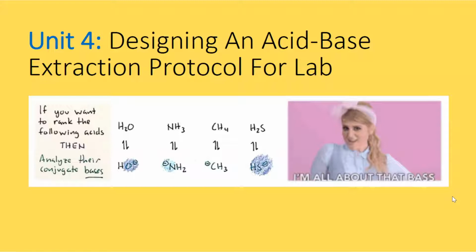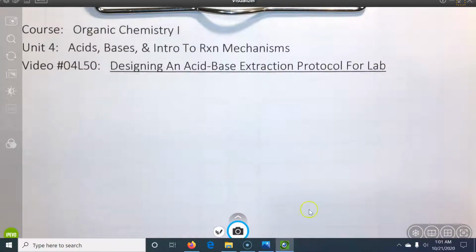We are going to choose a weak base and a strong base, and by putting the extraction protocol in the correct order and how we use those bases, I think we'll be able to separate selectively these three compounds and get them all isolated. It'll be no trouble. Let me show you the three molecules that we'll be working with.